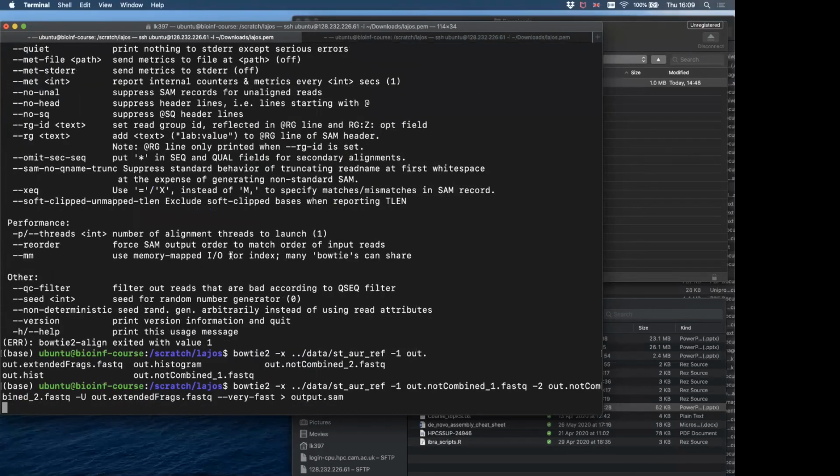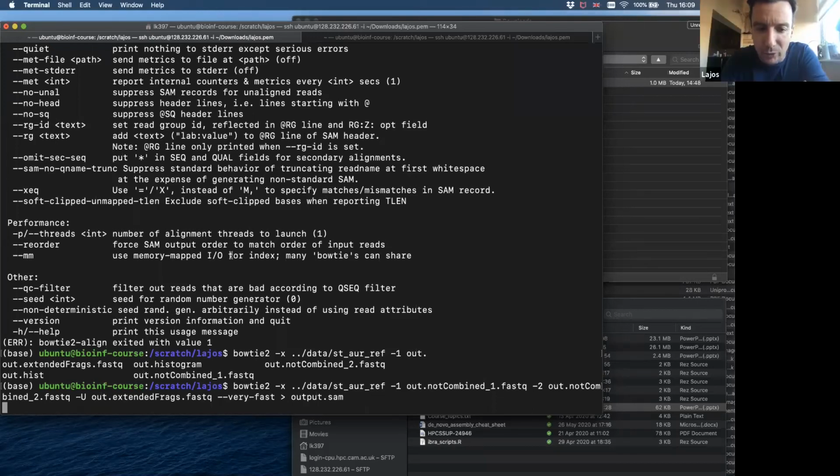Lajos, I have a question about the non-combined sequence. Usually, if you have a sequence with two paired ends, you use the paired-end FASTQ file to convert to a SAM file. But usually you lose the single-end sequences. Is this a matter or not? In our case, we are using all three files at the moment.